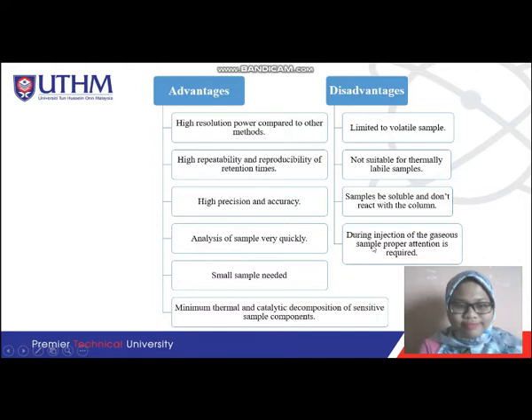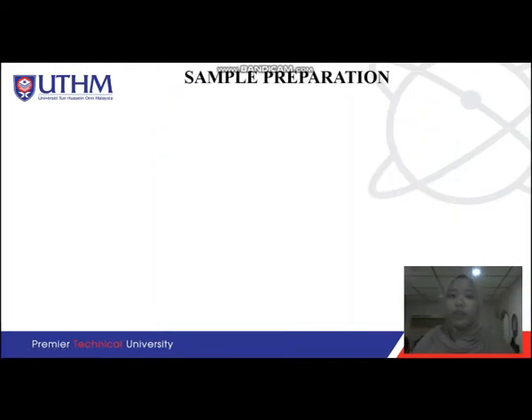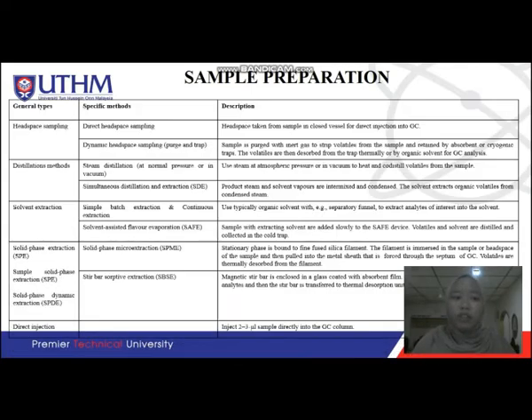Thank you. Okay, next, I will explain about the sample preparation of gas chromatography. First, there are 5 types of sample preparation: headspace sampling, distillation method, solvent extraction, solid phase extraction, and direct injection. For headspace sampling, there are 2 methods. In static headspace sampling, the headspace will be taken from the sample in a closed vessel for direct injection into the GC.